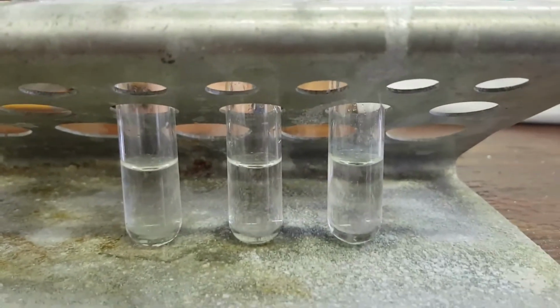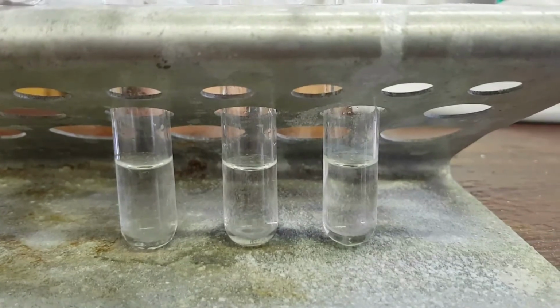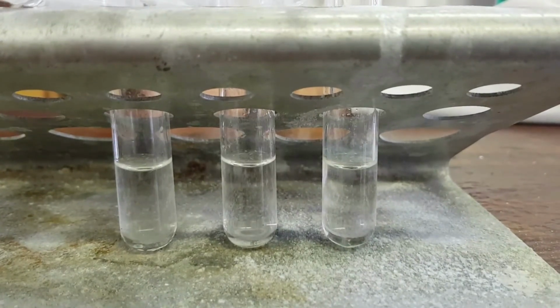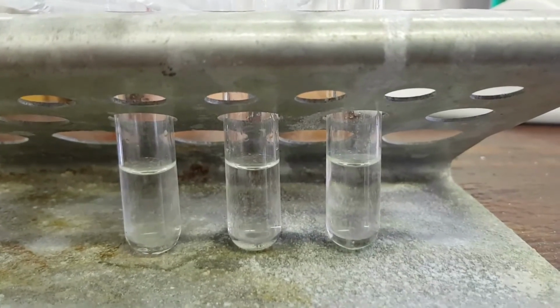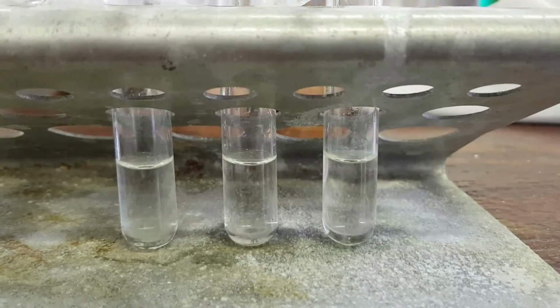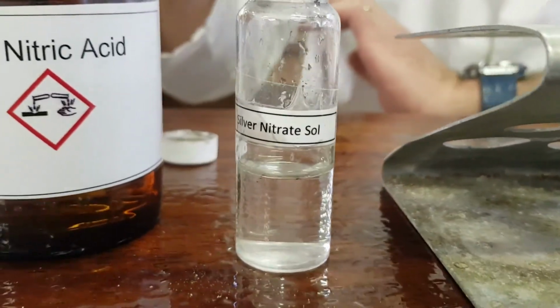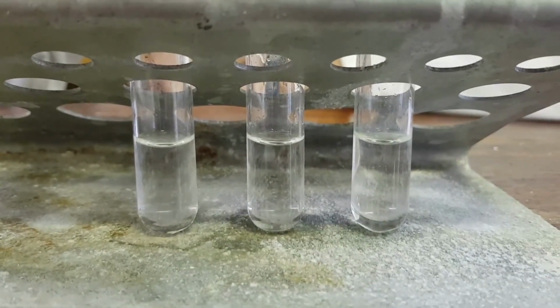So the first thing Mr. Reeves is going to do is add a couple of drops of nitric acid into these solutions. And I want you to think about why we might be using nitric acid rather than other common acids. Mr. Reeves is now going to add a few drops of silver nitrate solution to each of these, starting with the chloride on the left.